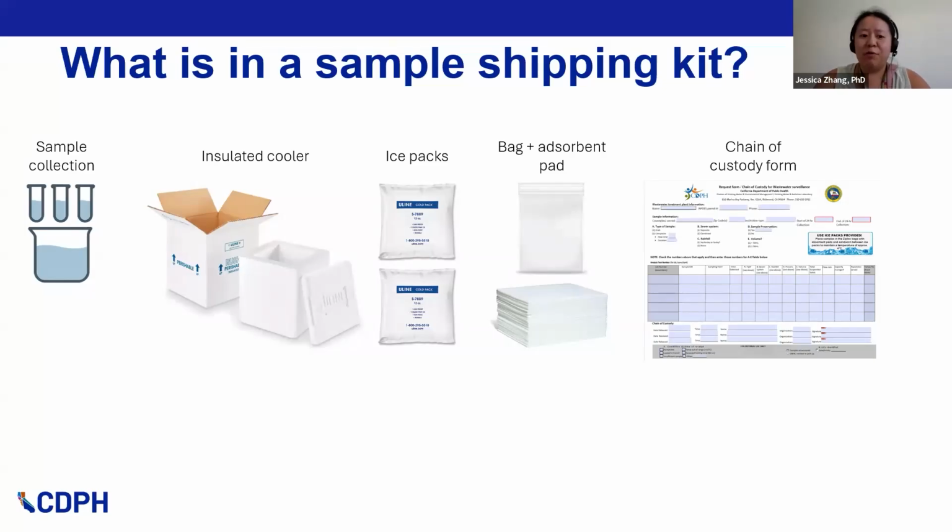And as a side note, when we receive 5 to 6 coolers in our possession from the same utility, we'll resume the cycle and ship them back to the utility so we can keep the process of sample collection and shipping going in a routine manner.